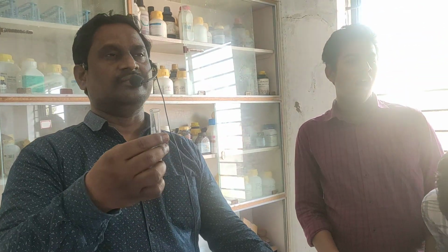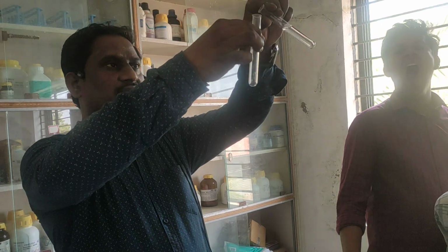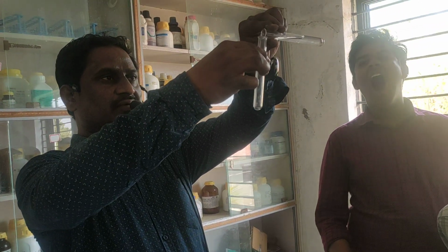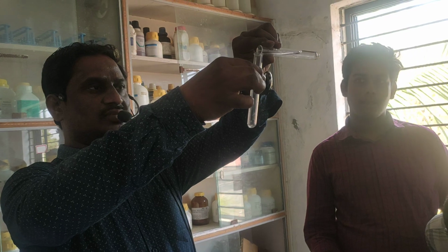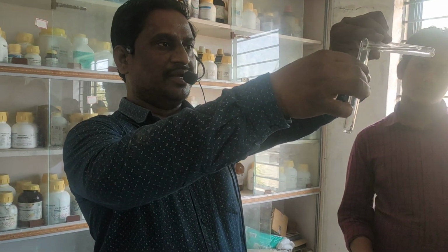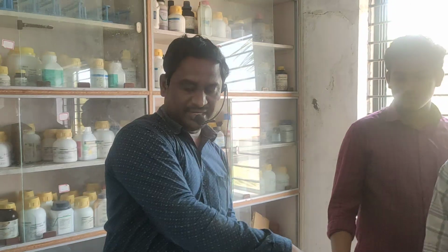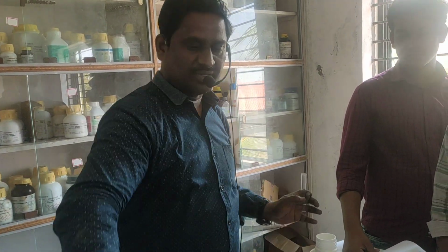Now let us perform the next test. Again I am taking a test tube and adding a little bit of the original solution. For this original solution, I have to add ammonium chloride. What should I add? Ammonium chloride. So I am adding ammonium chloride here.